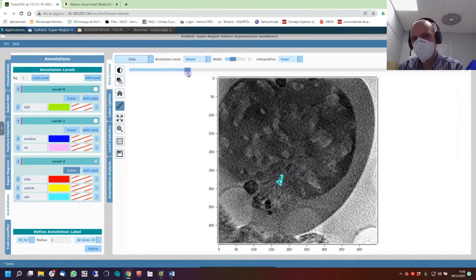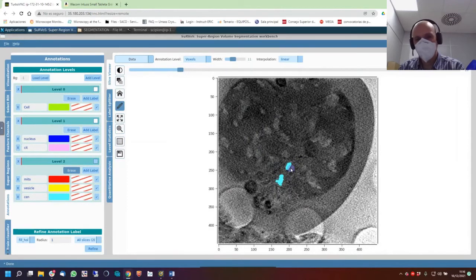Otherwise, you see, when you paint one but not the other, one but not the other. Fill up with this, you can try volume, refine. Let's see, refine, fine.